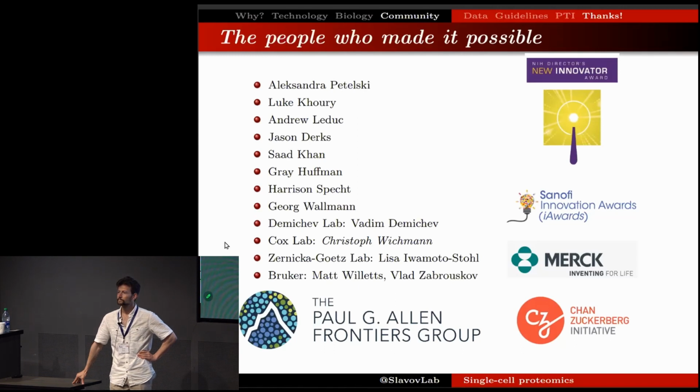Can I ask a basic question about single cell proteomics? Yes, so basically about the imputations and missing values. In terms of these imputations for a typical shotgun proteomics, we are expecting similarities, right? But for single cell proteomics, there are differences. That's why we are studying these heterogeneities. So can you comment on these strategies, how you imputed the missing values?